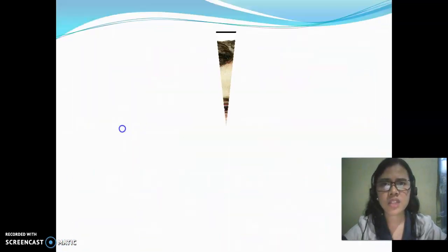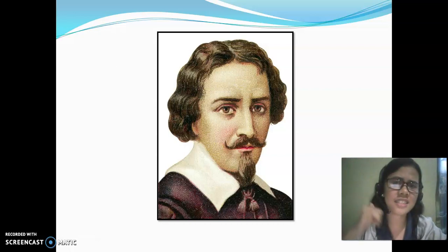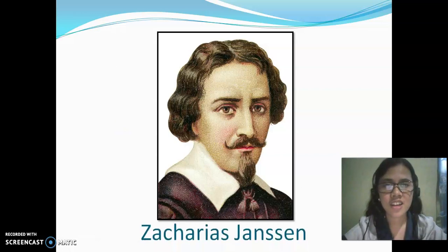Every major field of science has benefited from the use of some form of microscope, an invention that dates back to the late 16th century and was invented by a modest Dutch eyeglass maker named Zacharias Janssen. While extremely rough in image quality and magnification compared to modern versions, the Janssen microscope was nonetheless an influential advance in scientific instrumentation.